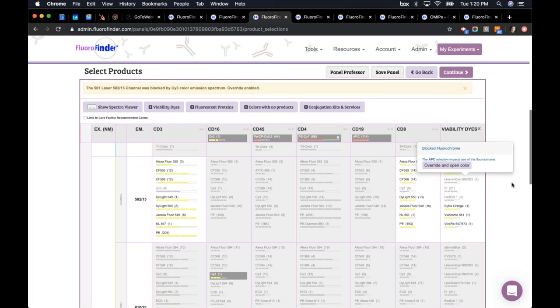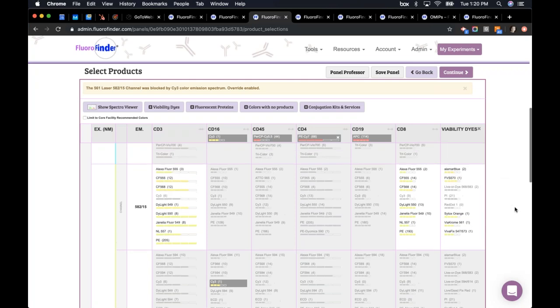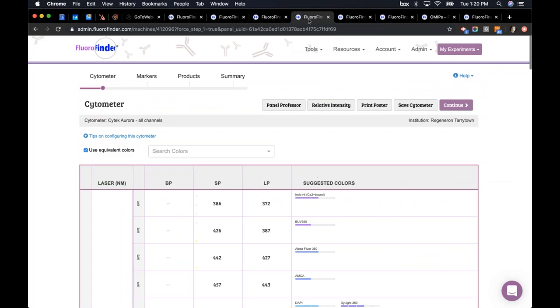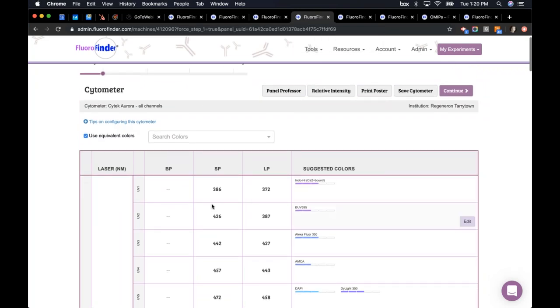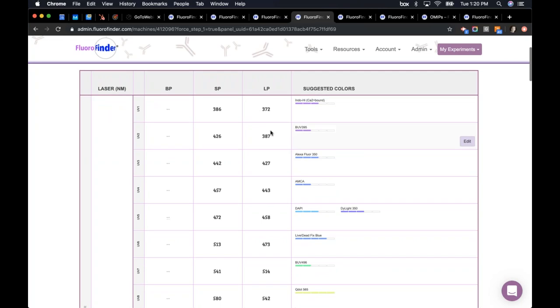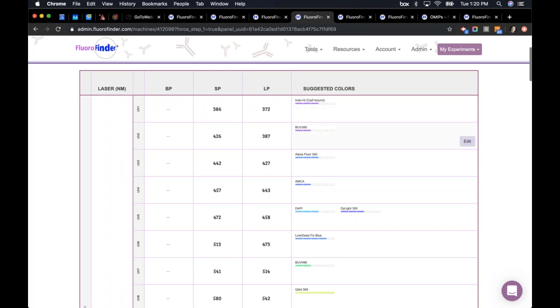I should point out a difference between traditional and spectral cytometry: for spectral cytometers, FloraFinder does not do this channel blocking. This is a configuration of a spectral machine in FloraFinder — in this case a Cytek Aurora. We've used short pass and long pass filters to describe what we call virtual channels. Here I can see my long pass at 372, short pass at 386, and then without any gaps, each channel covers the entire spectrum all the way down the line.